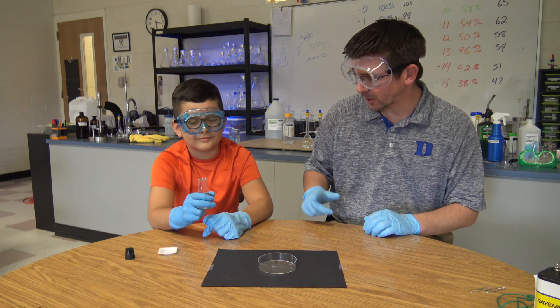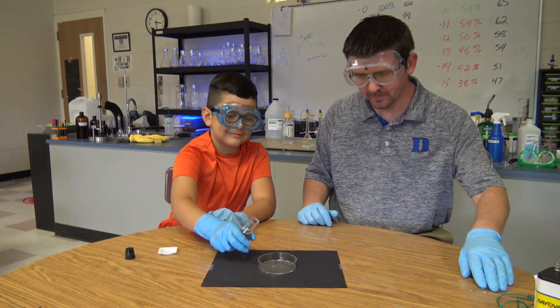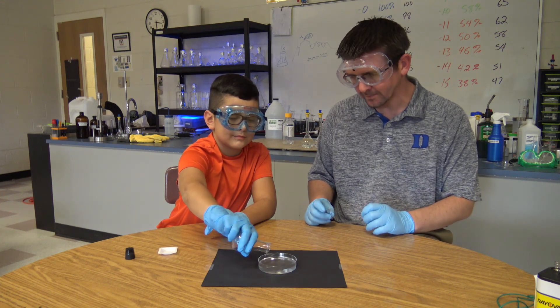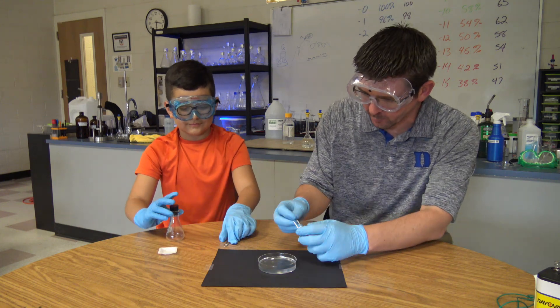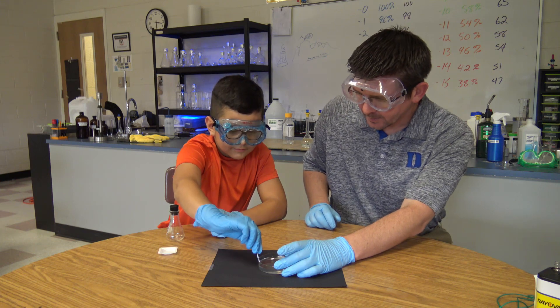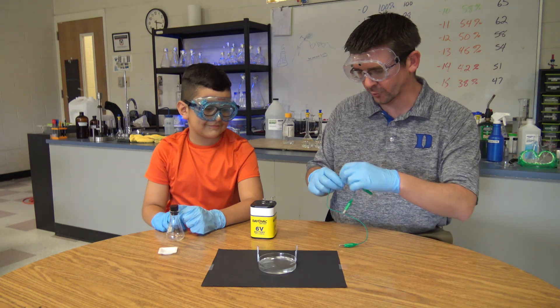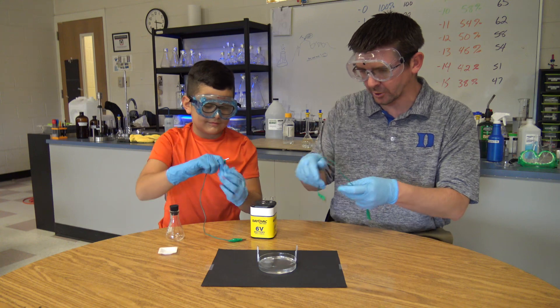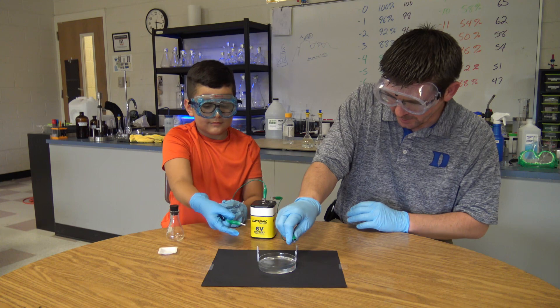We have our clear tin(2) chloride solution now and Hunter is just going to add that to a petri dish. And that's about good there. Go ahead and clip one of these paper clips on one side. I'm going to clip one on the other side, and we're going to have paper clips on opposite sides of the dish. That way when we hook up our battery, the electrical current is going to flow through. Hook the alligator clip to the negative end and hook that onto your paper clip. I'll hook this on the positive end and hook it to mine.